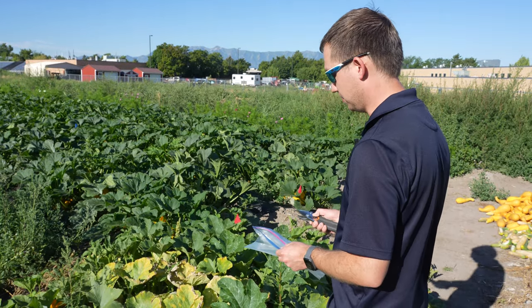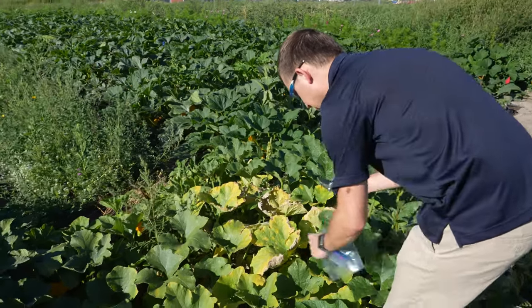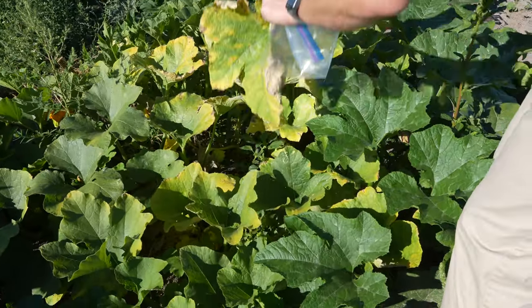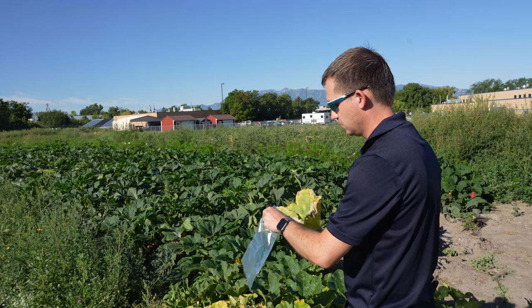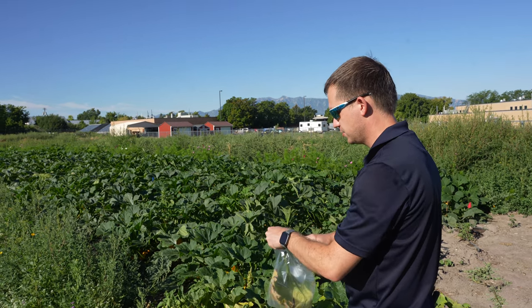Then it is okay to collect that sample. You want to collect any symptomatic tissues. In this case, since we have a really large leaf here, I'm just going to prune off that one leaf and place it directly into a plastic bag.